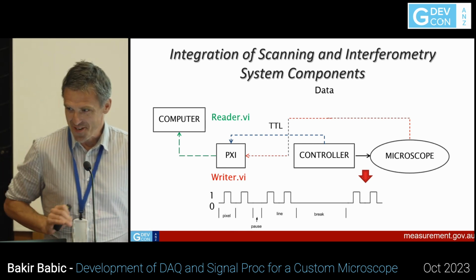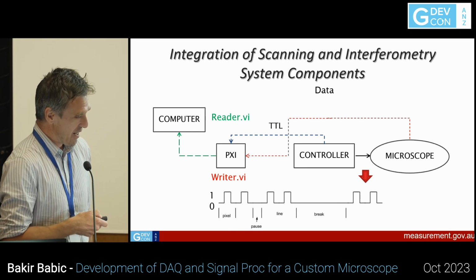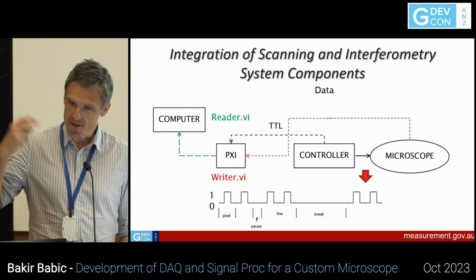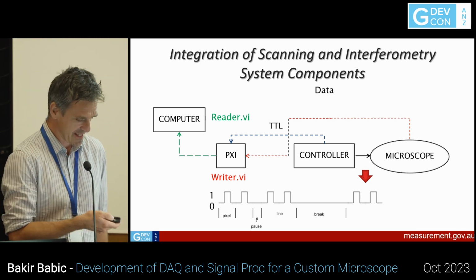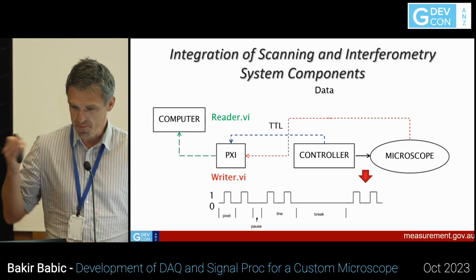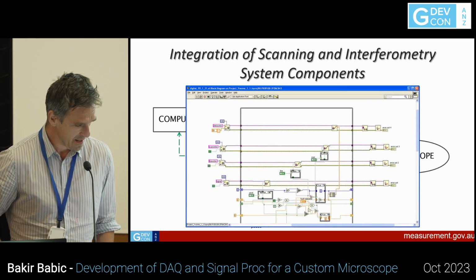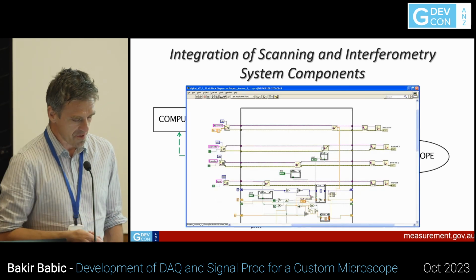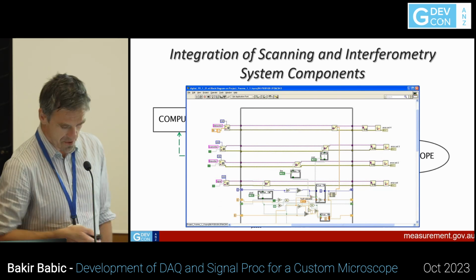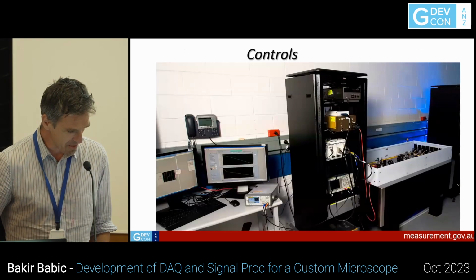And that's maybe something which LabVIEW is not good at. I have to have some critical thing here about LabVIEW. And obviously another option is to even have a timestamp and then do everything offline, but that's harder. So having a TTL signal, putting an appropriate card in the PXI gives you this counter and triggering event. And then you have to get the data from the RT to your computer. You have to transfer the data. You may have some issues, but eventually you will make it work.